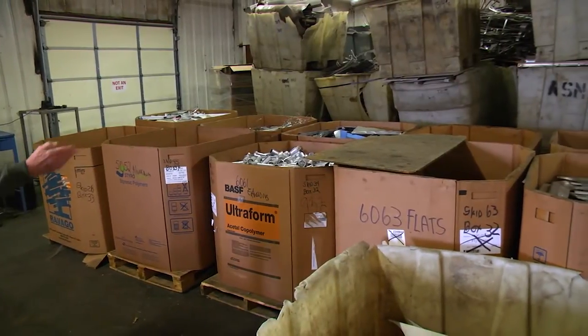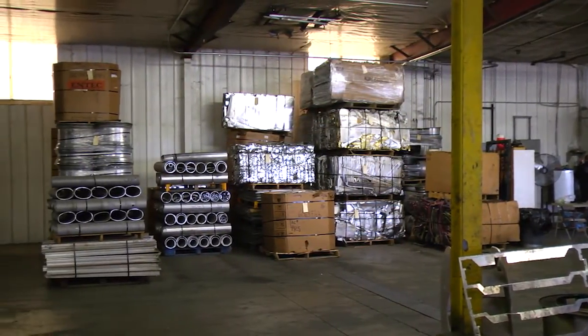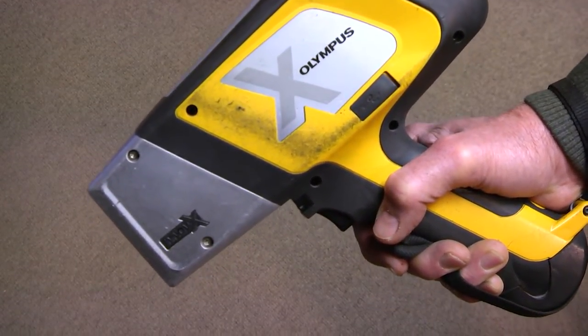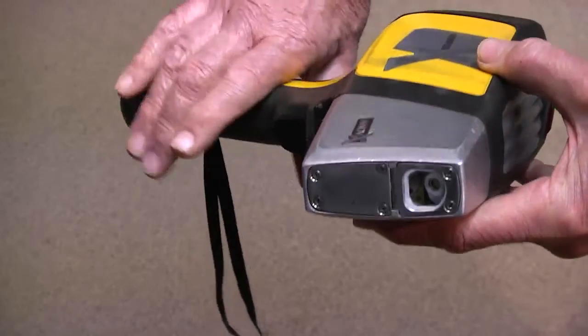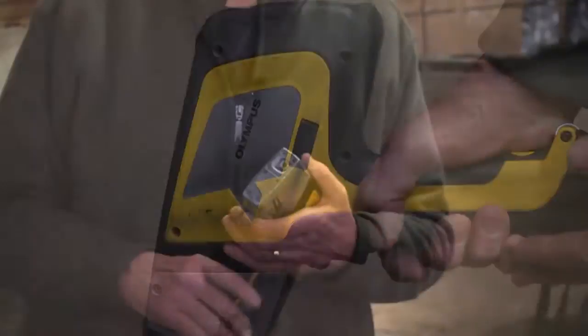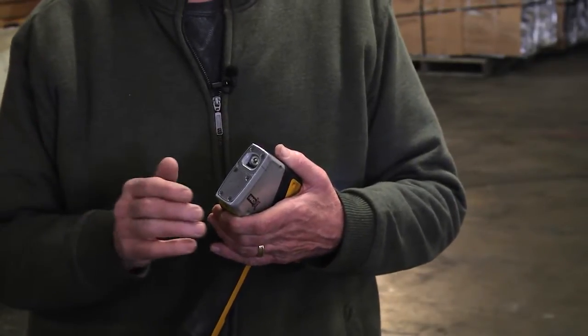This facility here is where we do all of our processing. We are currently on our second edition of the Olympus gun — I believe this one is two years old. We had the previous model for about four to five years. It was still operational; the only reason we changed was the newer model had an enhancement of a library.